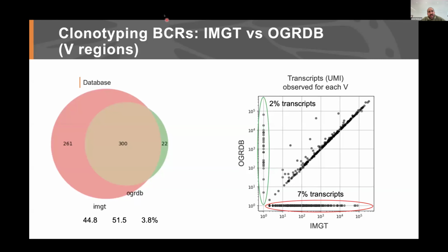The problem is that even if I compare to the sequence grouped by UMI, for example, where in the consensus I know very well if a mutation is actually what I should be seeing, I still don't know if that allele is present. Maybe in the sample we do have the other allele and I'm not seeing it in this transcript. Am I clear with what I'm saying? So I don't have that confidence.